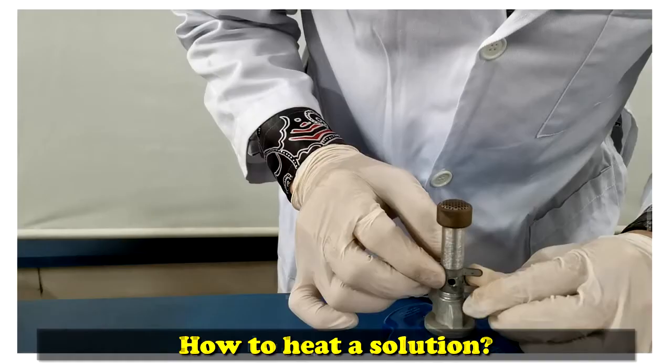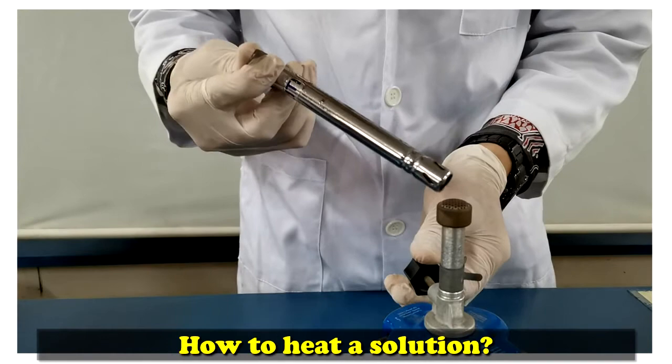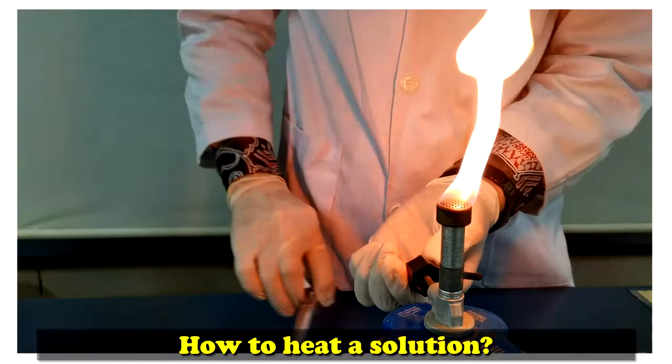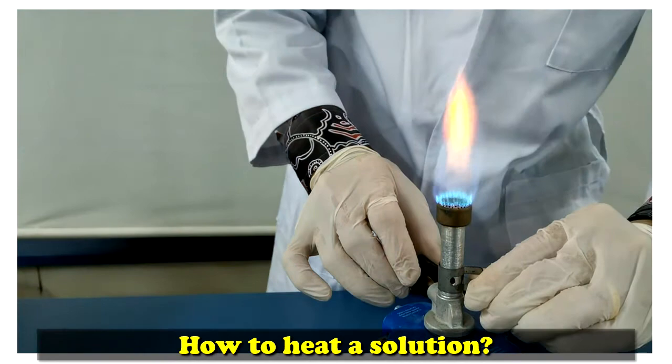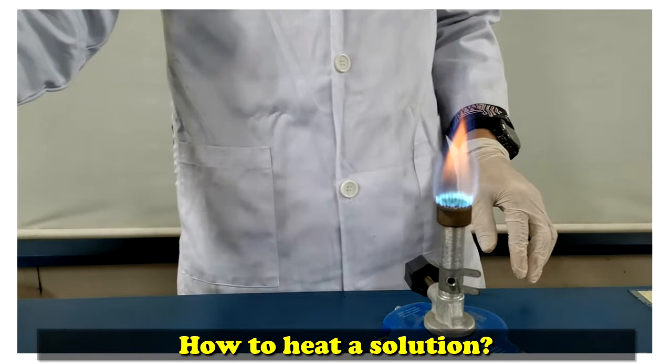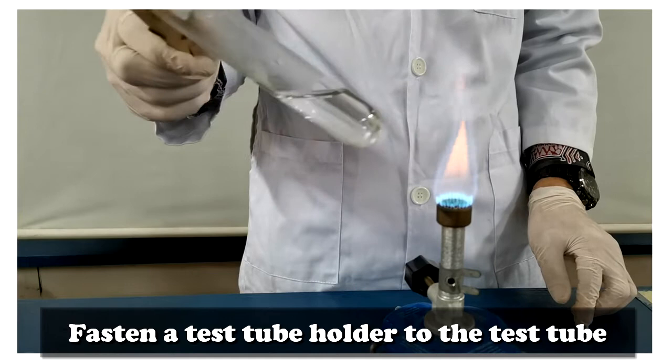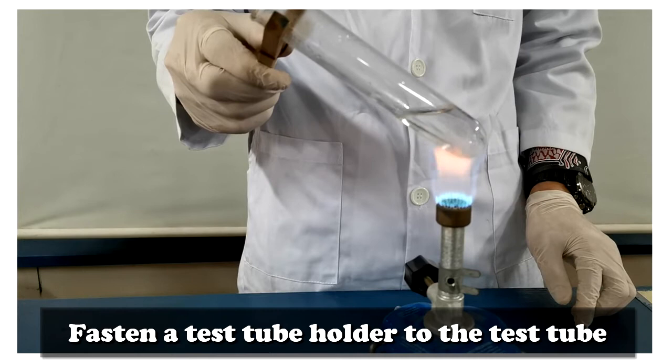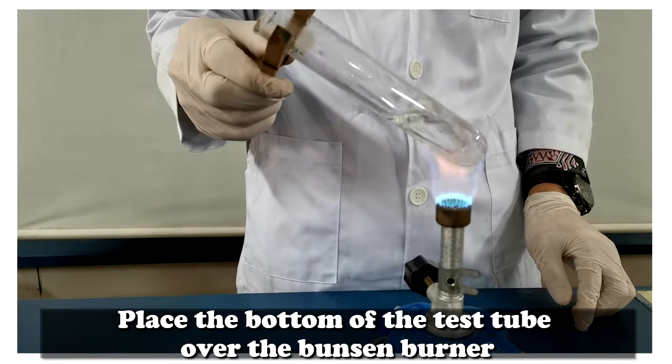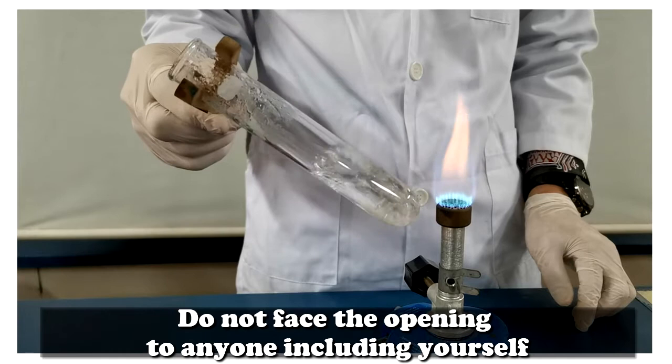How to heat a solution? Fasten a test tube holder to the test tube. Place the bottom of the test tube over the Bunsen burner. Do not face the opening to anyone including yourself.